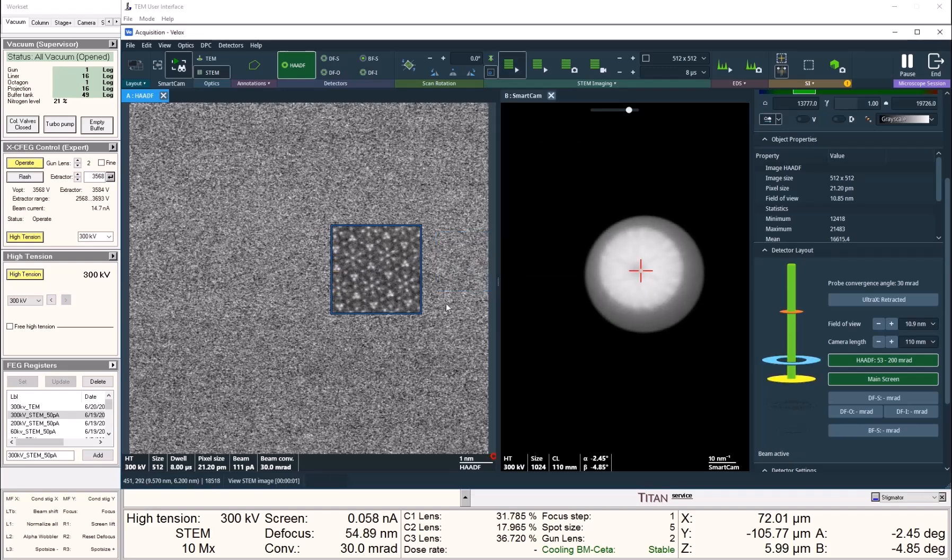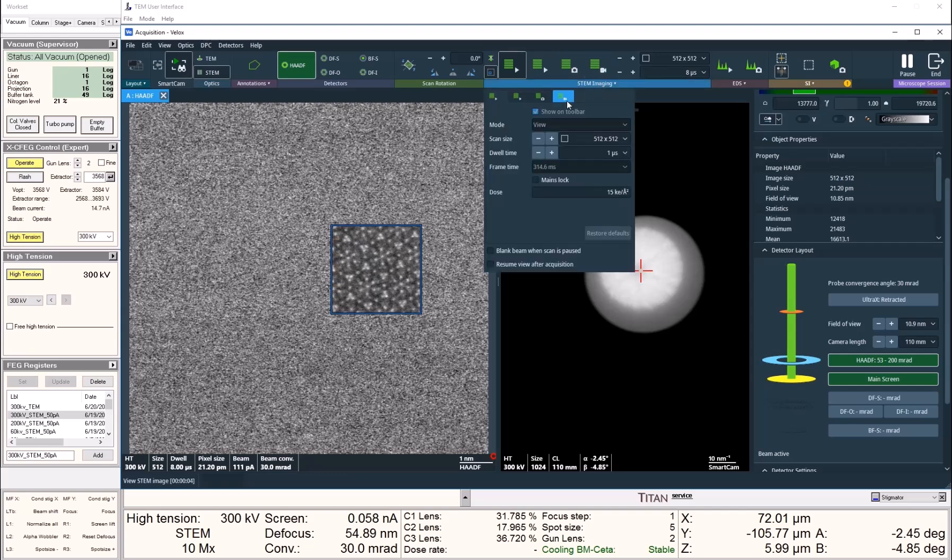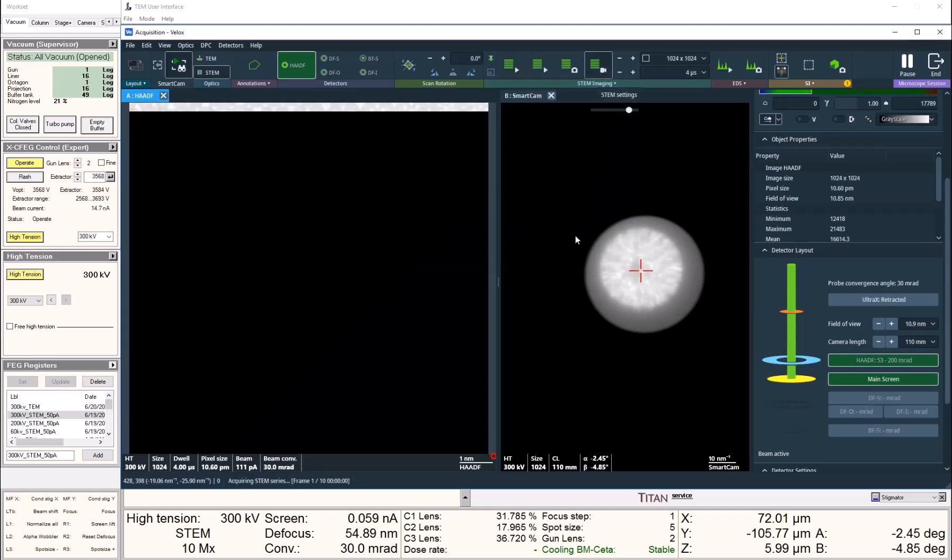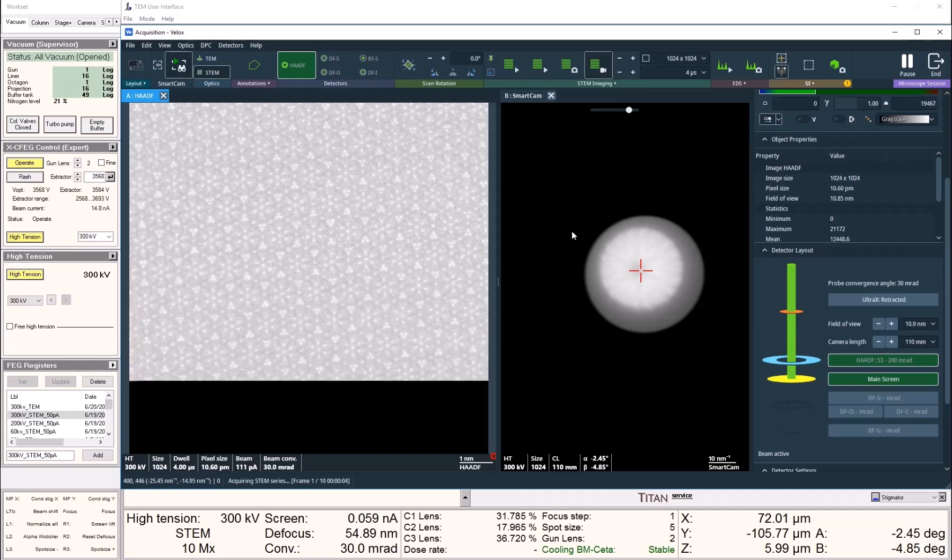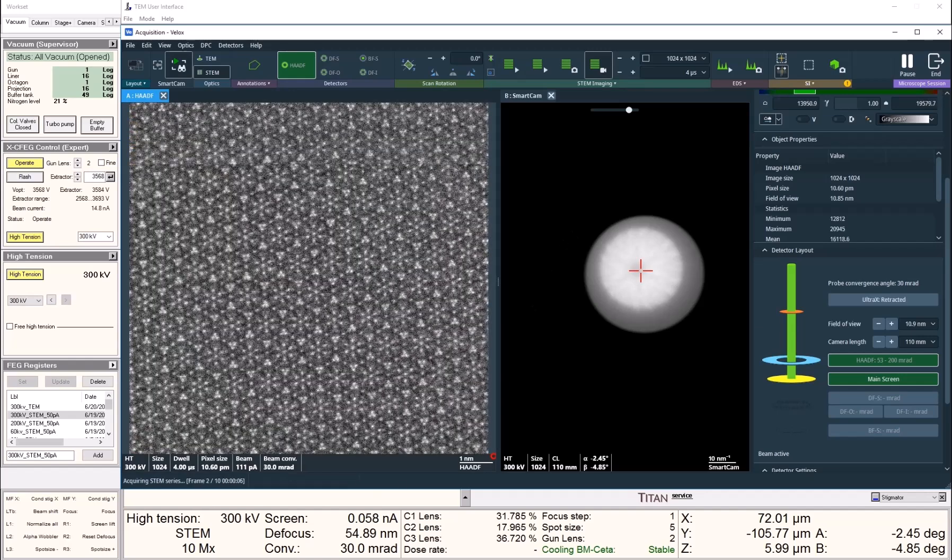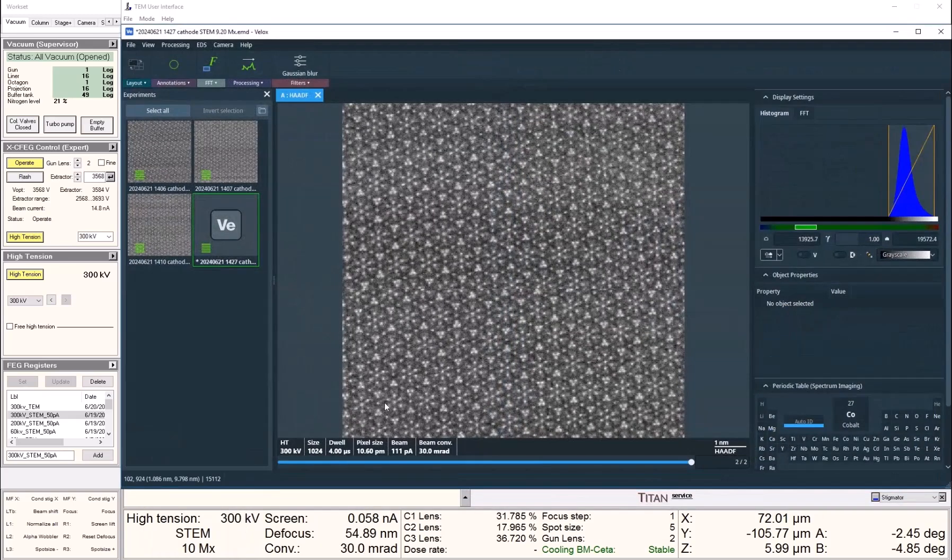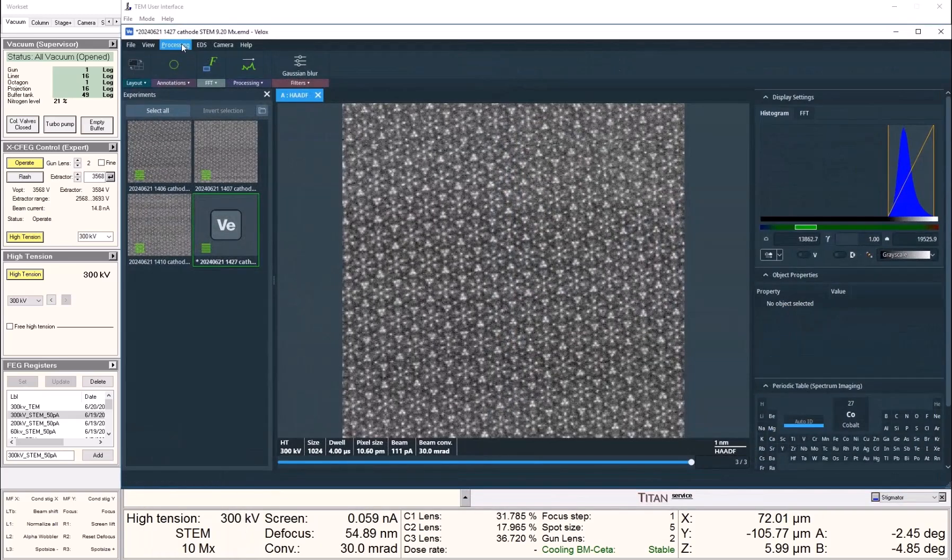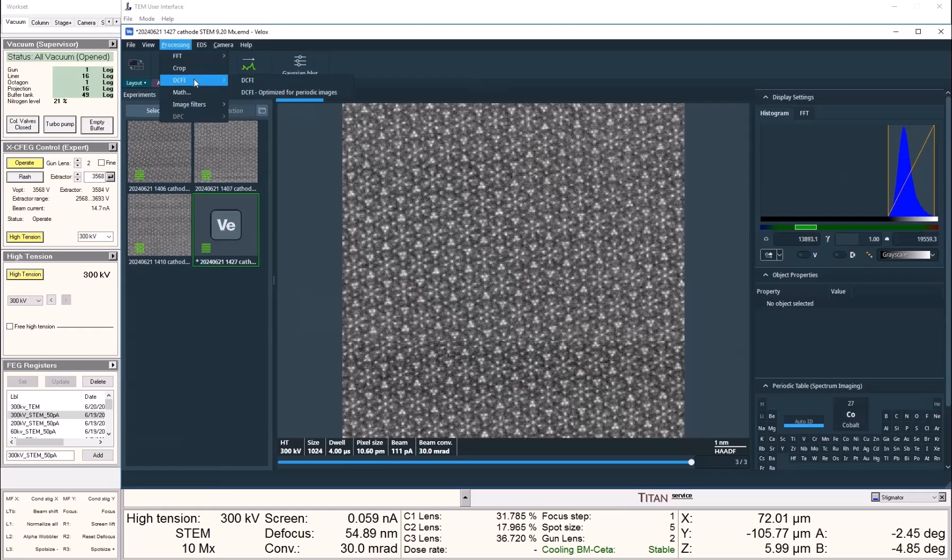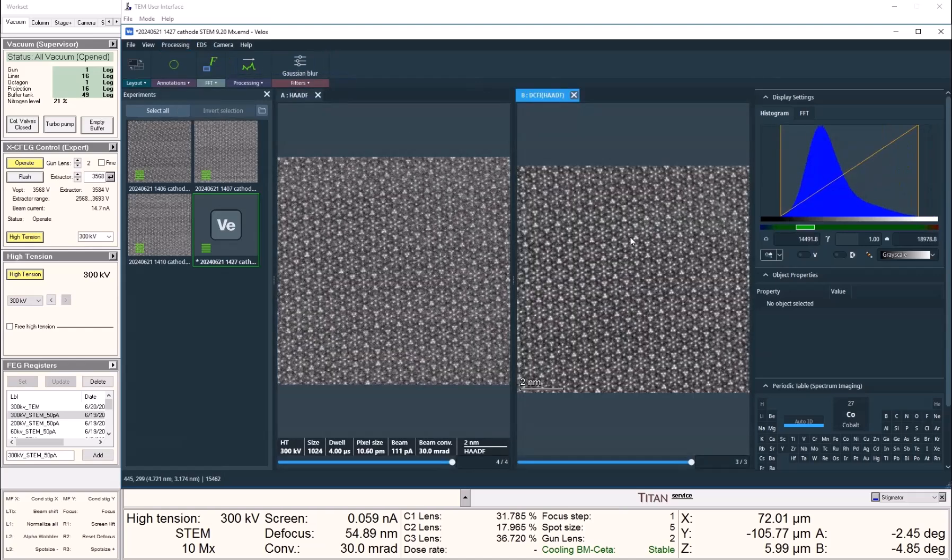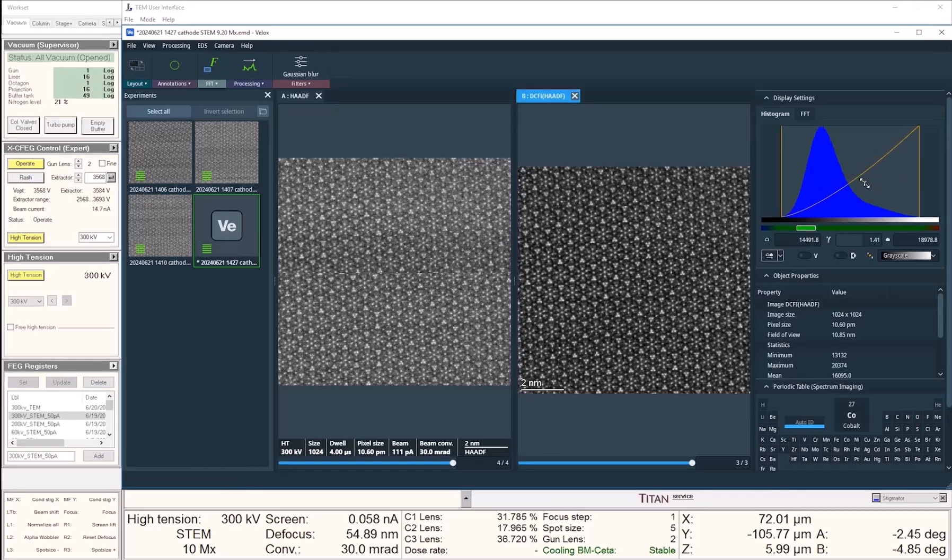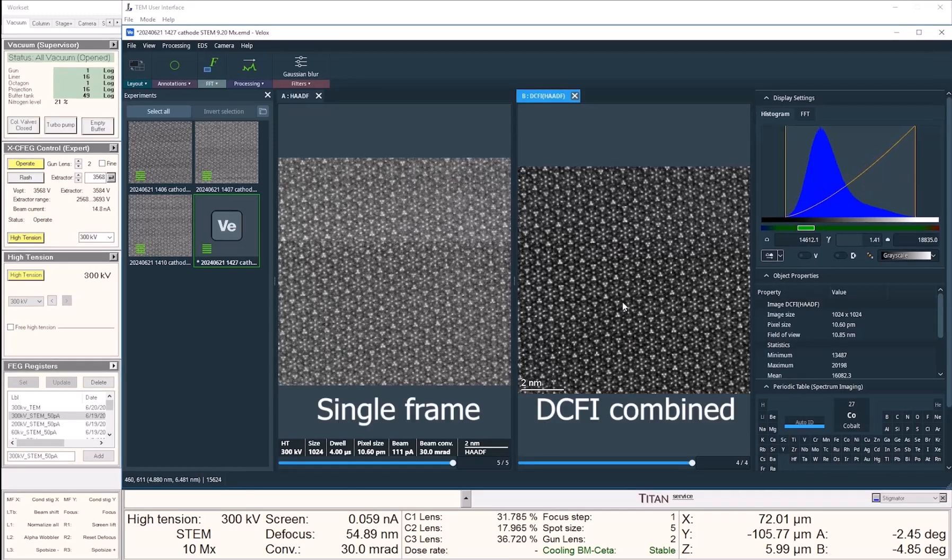We can now take a series of images and use the DCFI function to sum those images. If you are not yet familiar with our DCFI tool, you can also refer to our previous videos for more details. DCFI here stands for drift-corrected frame integration. It minimizes the effect of any sample drift, and you can tell immediately that it's very effective in improving our image signal-to-noise ratio.